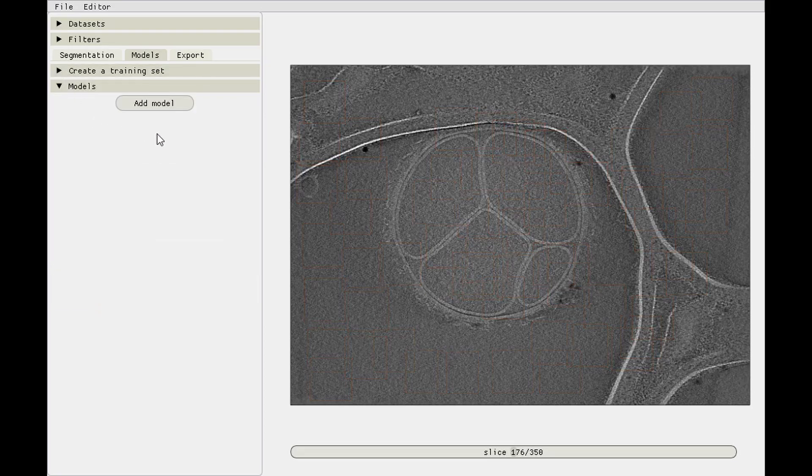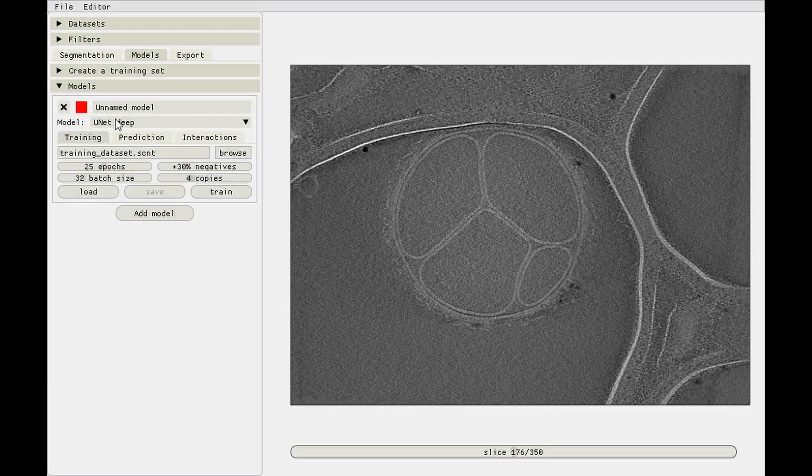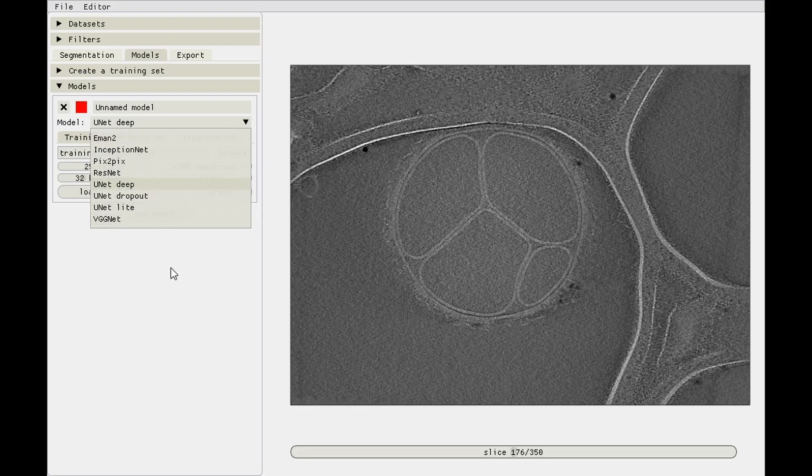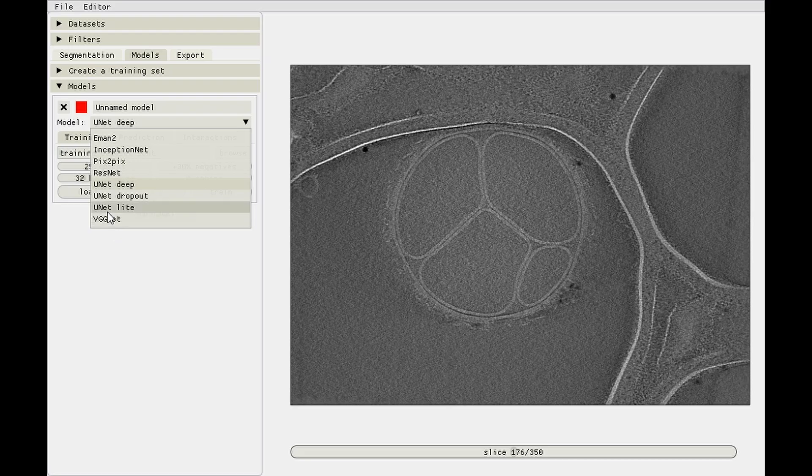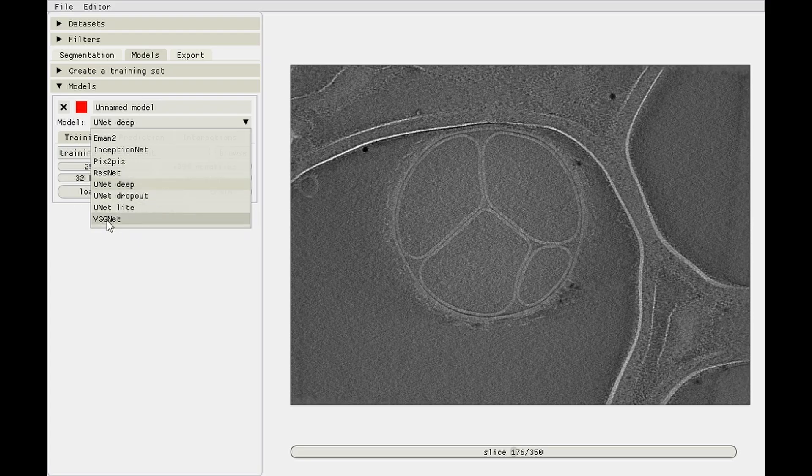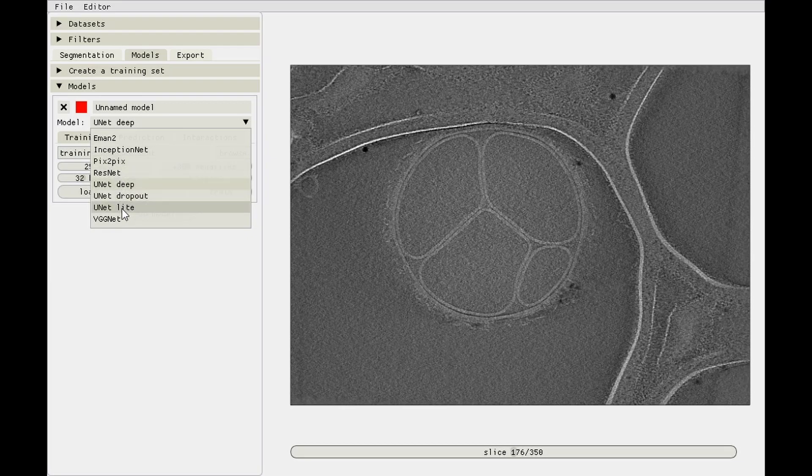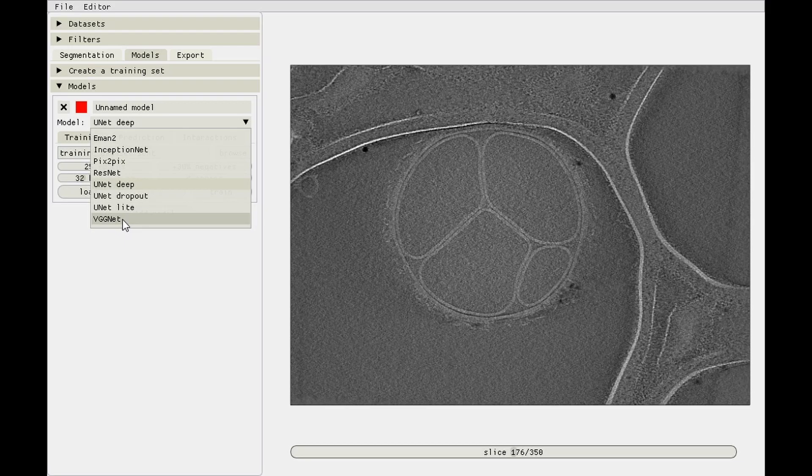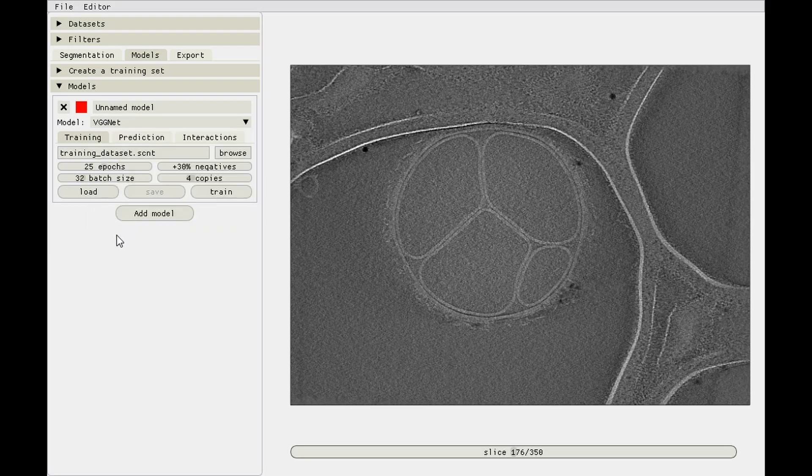On to the first model, add a model. We used UNet Deep in a previous video which usually works quite well. In the paper we saw that VGGNet actually works best for the membranes, unless someone comes up with a better model. You can probably make VGGNet or maybe UNet Deep a little bit deeper. These ones both have about 1 million parameters, whereas Pix2Pix has 27 million if I remember correctly.